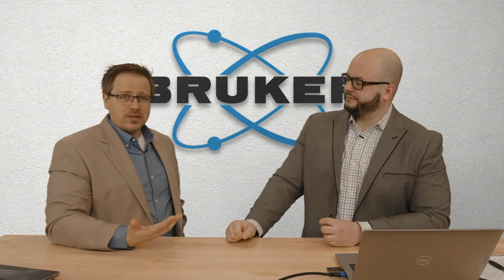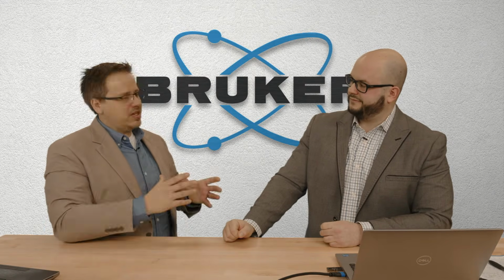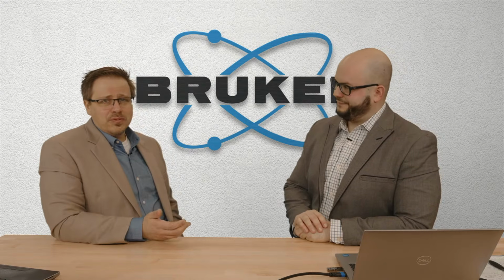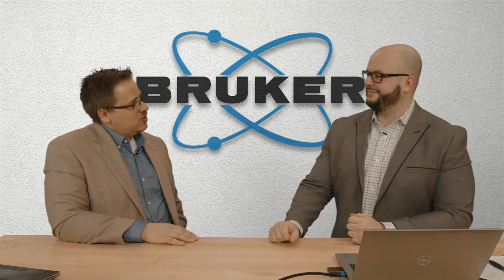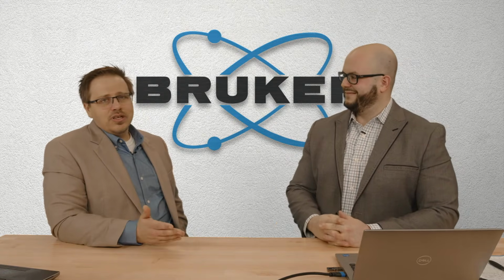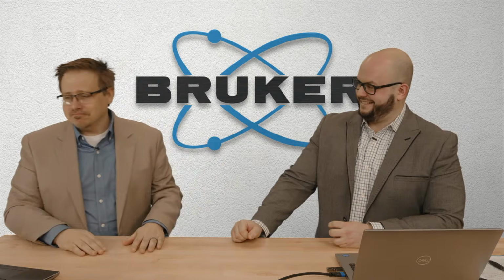Generally, for residual stress, you shouldn't have any texture. What I found is that the 2D method, because it's modeling the whole diffraction pattern, is a little bit more robust. Yeah, definitely. So you have a better potential. But if you're looking at something pretty strongly oriented, like a copper film that you deposited, that's a tricky one. It's going to be a challenge. In fact, we have had questions where people want to do residual stress on an epitaxial film. Well, you just have to go back to fundamentals and say, you don't need stress, you just measure the lattice parameter. Exactly, and now you get the strain.